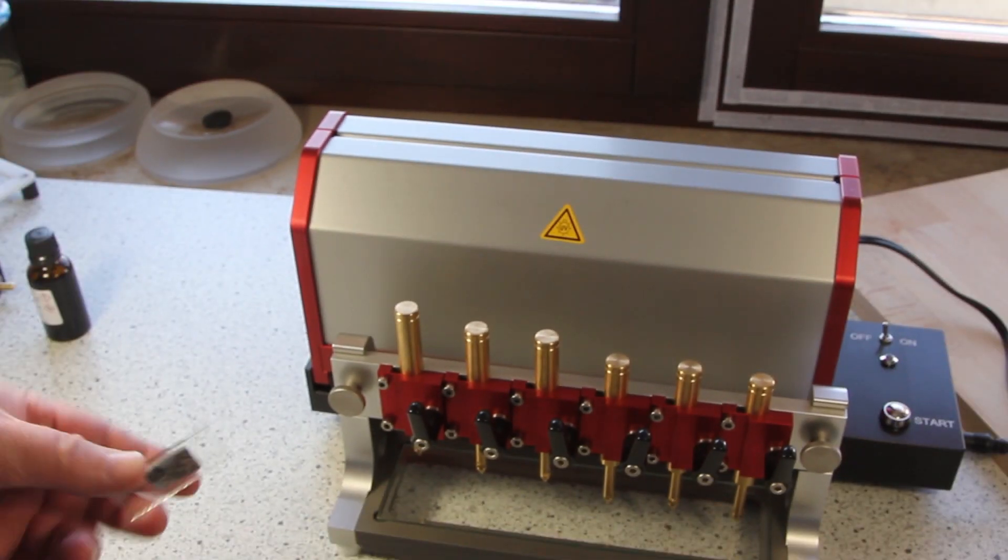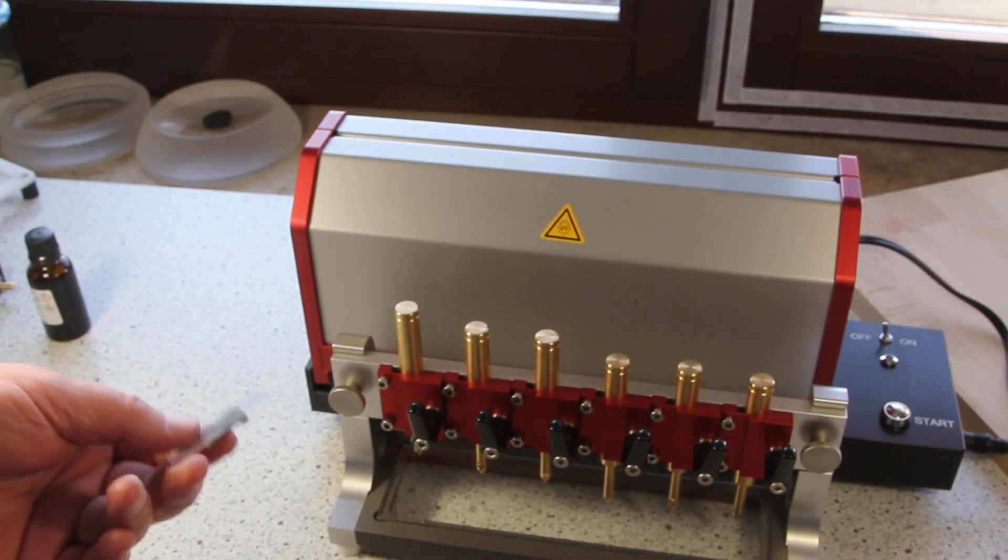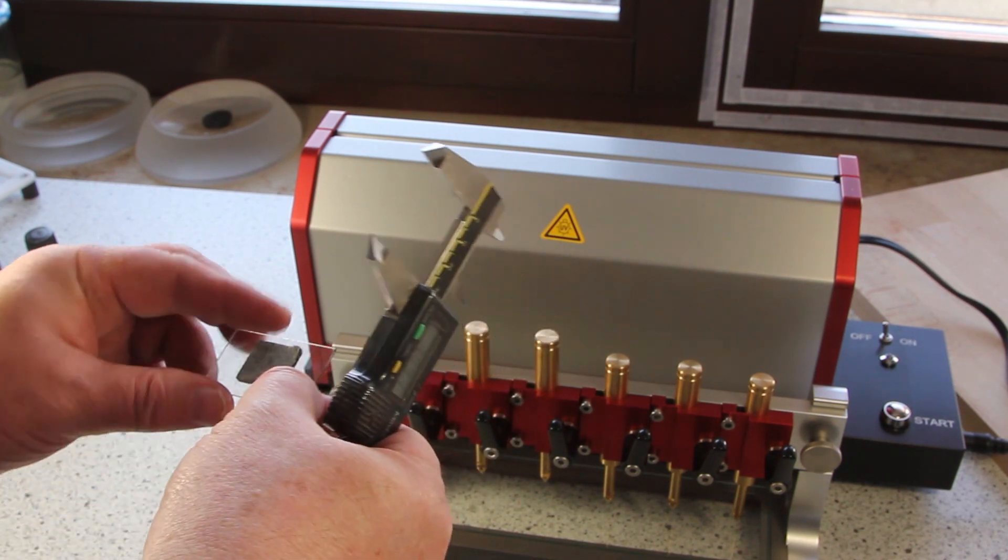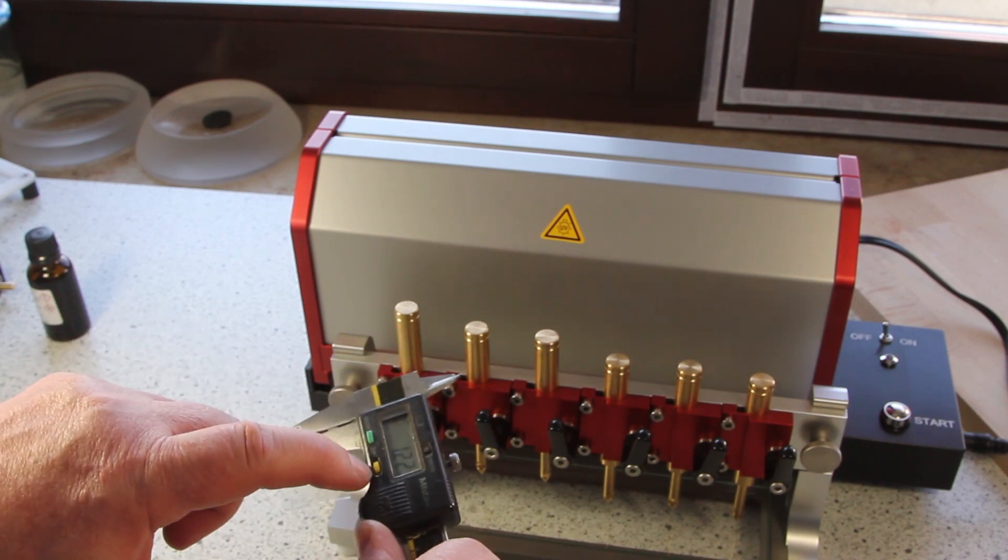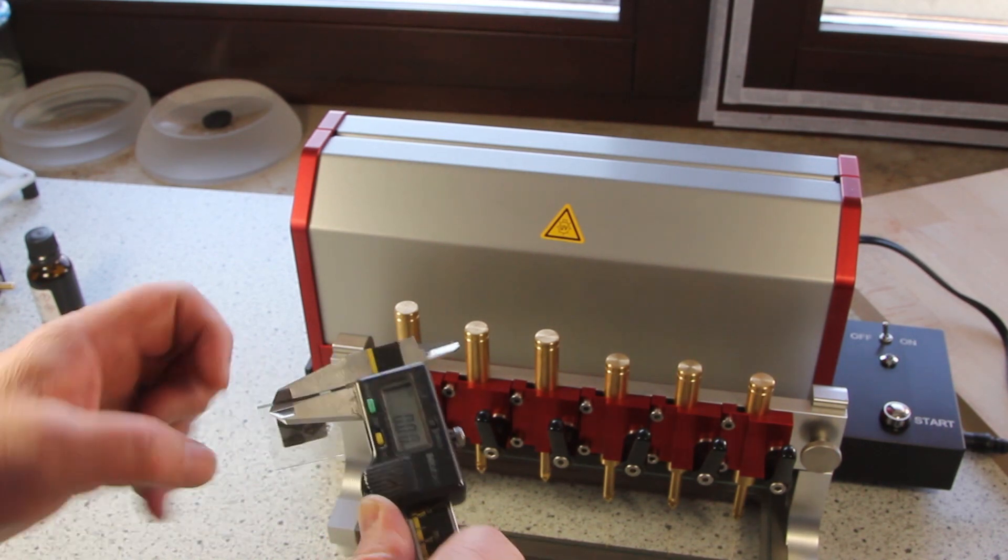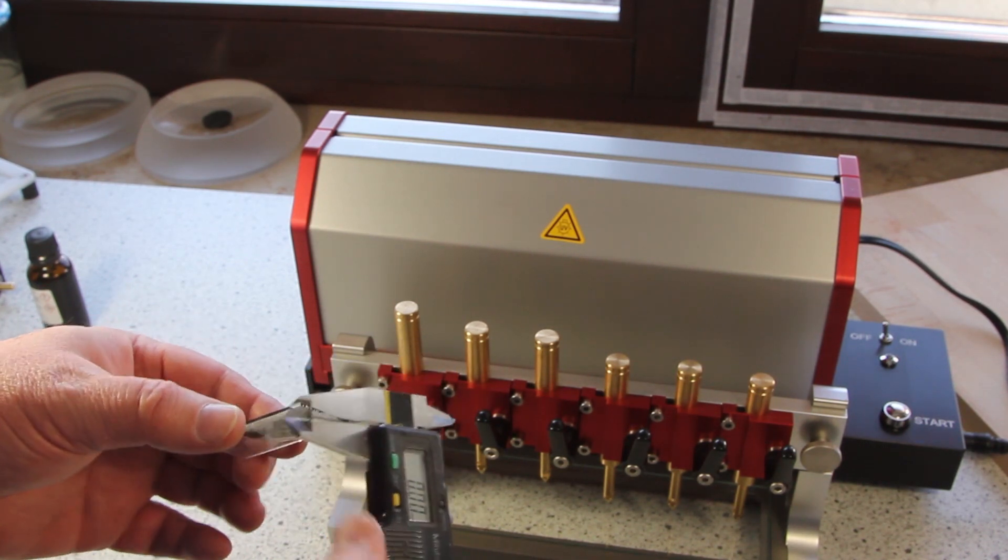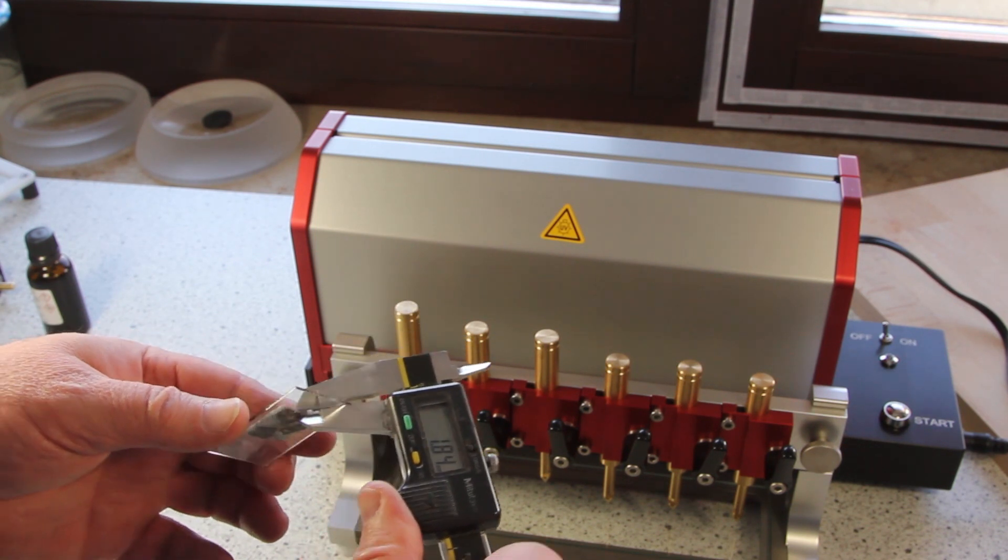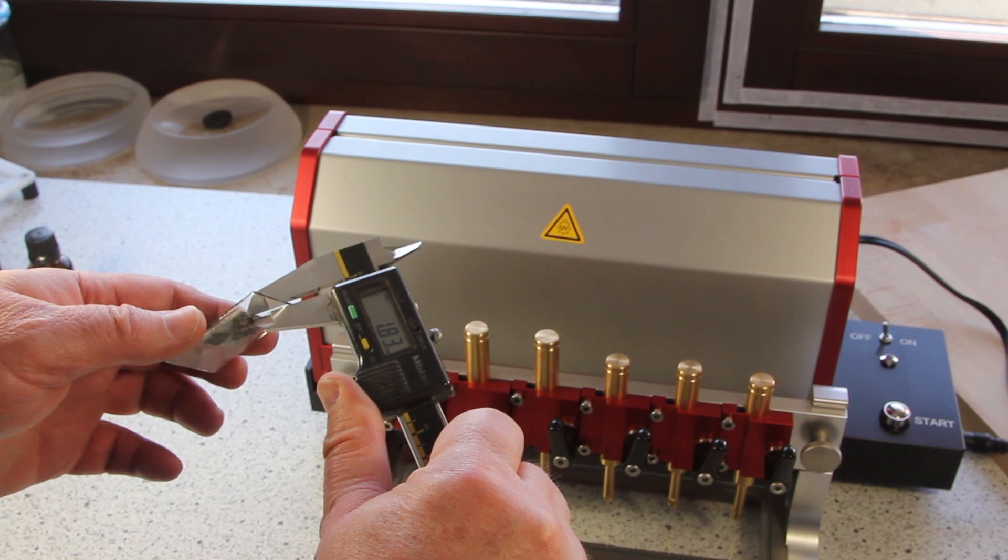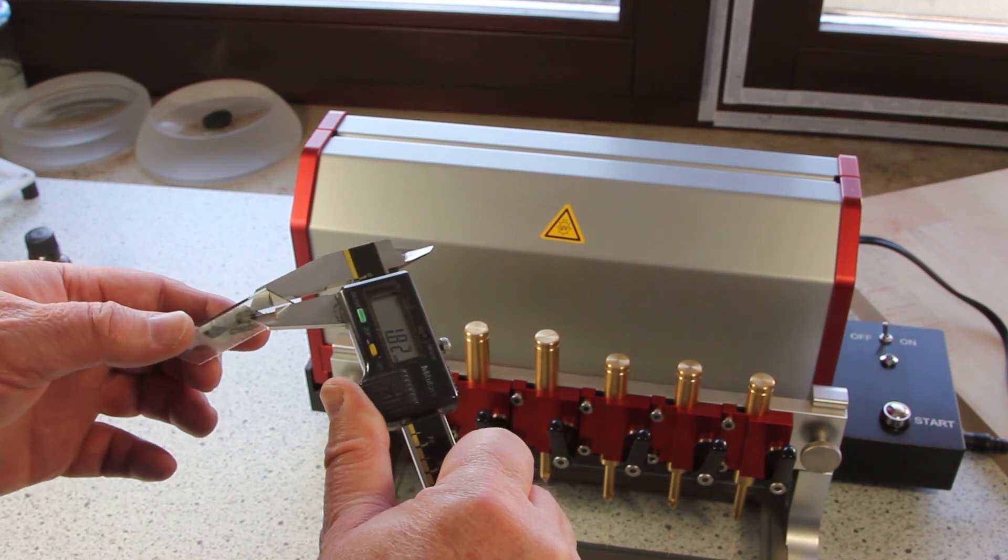And now it's good to know how thick the samples are. So I set my caliper on zero on the glass. And I can see that the sample has a little less than 2mm.